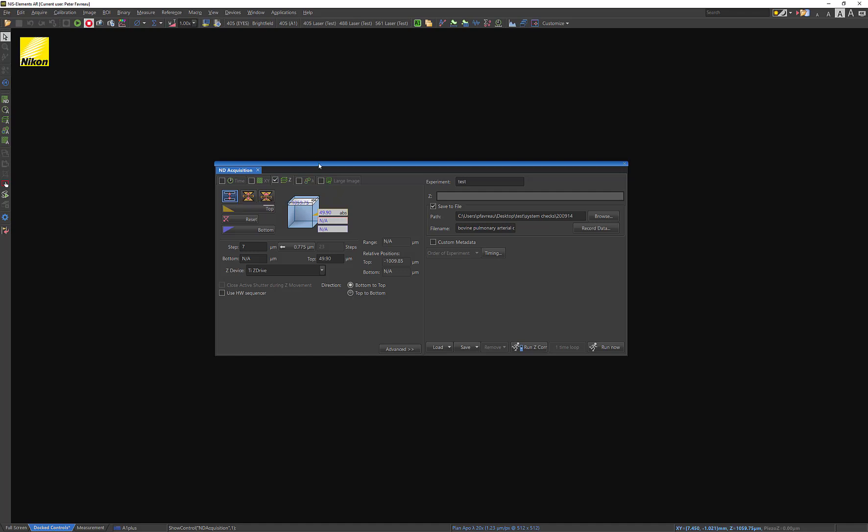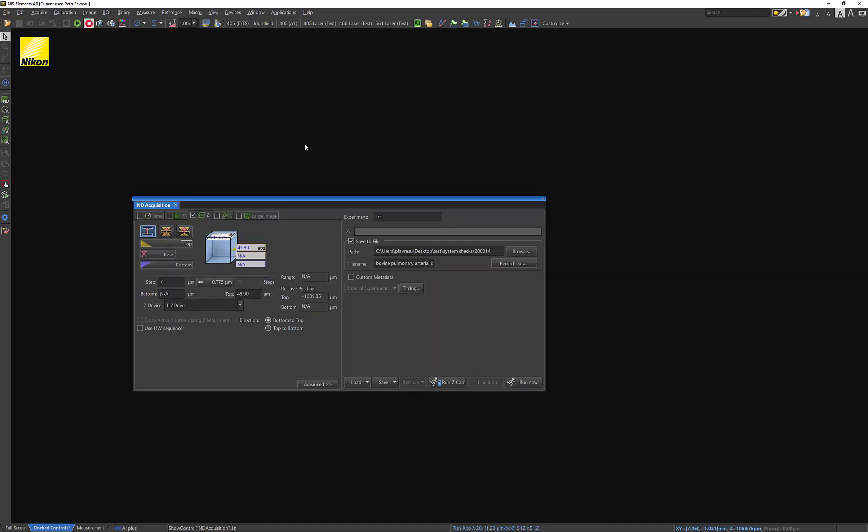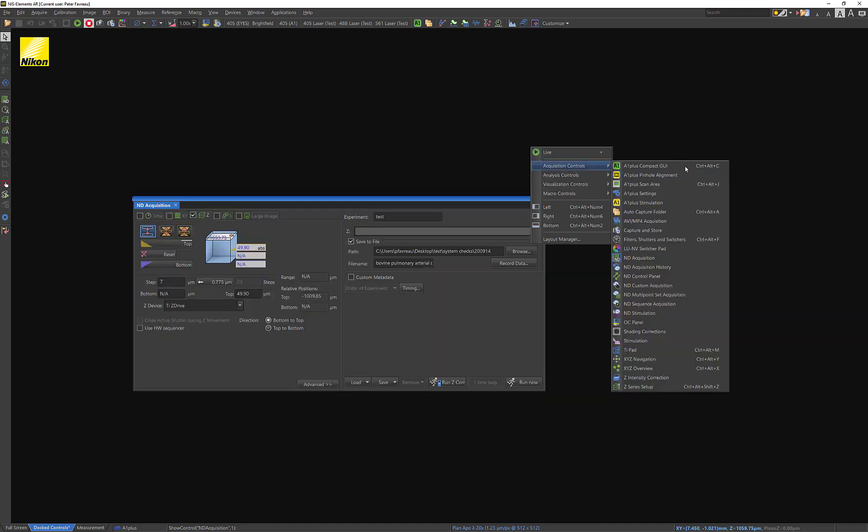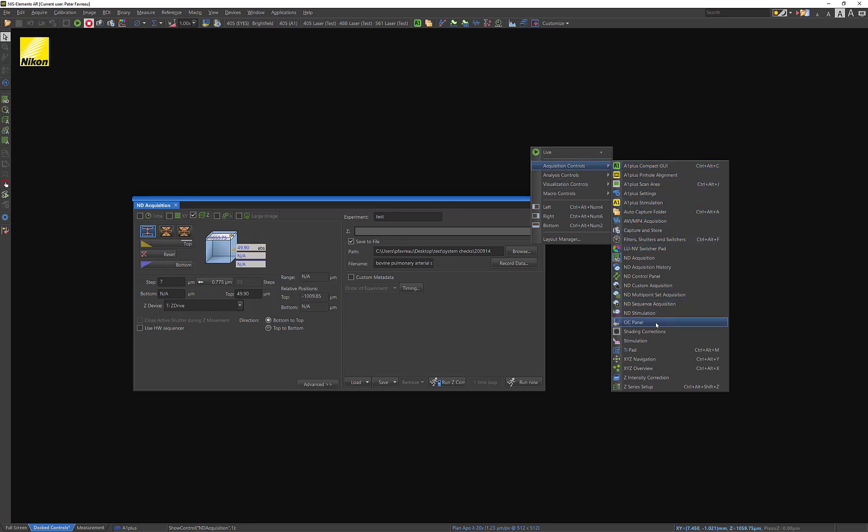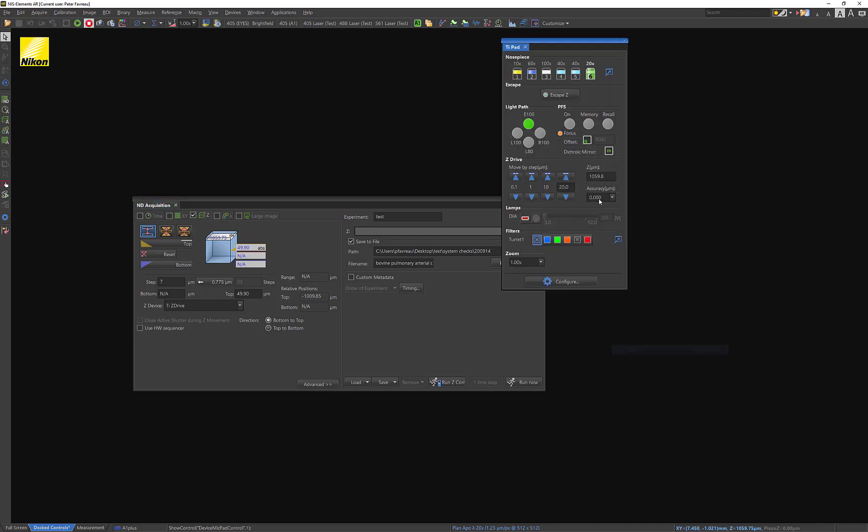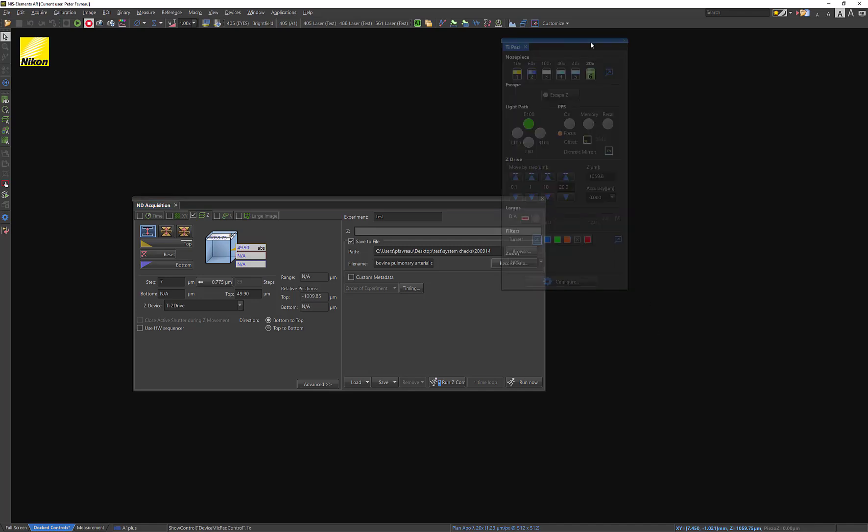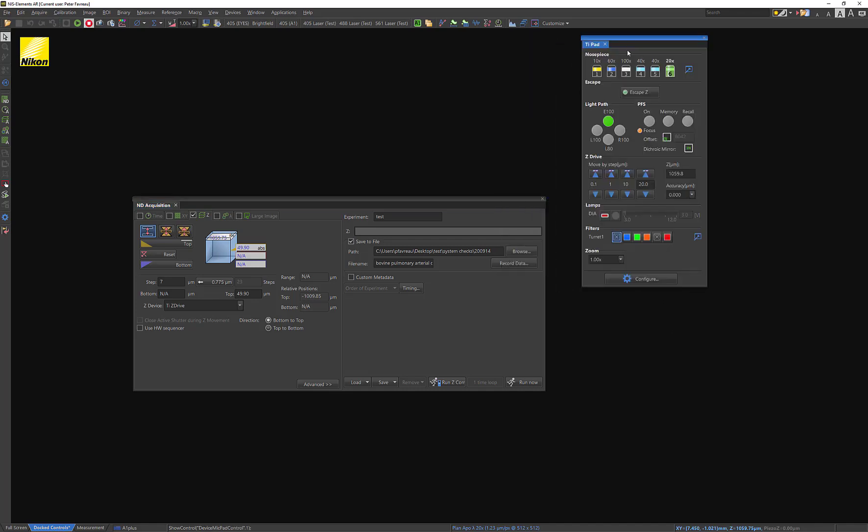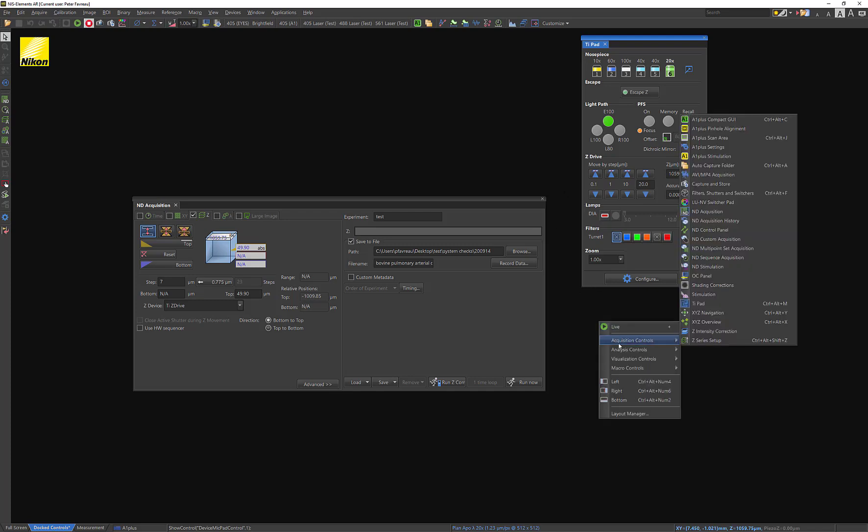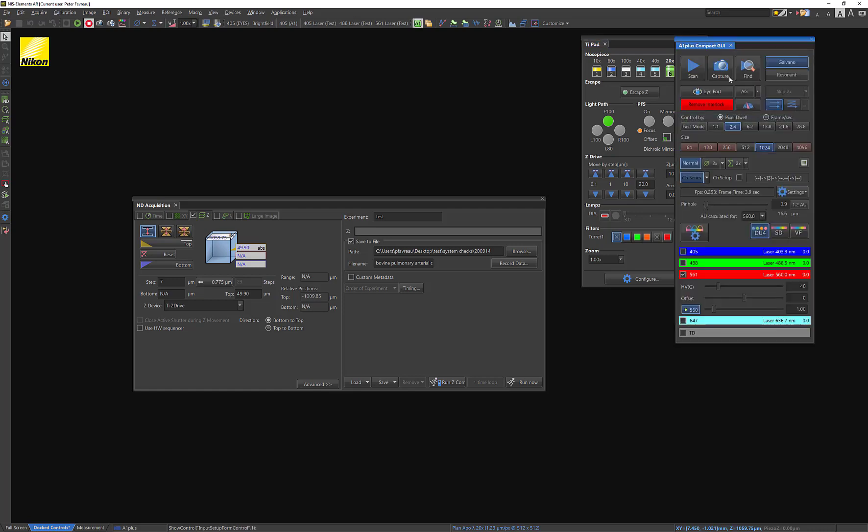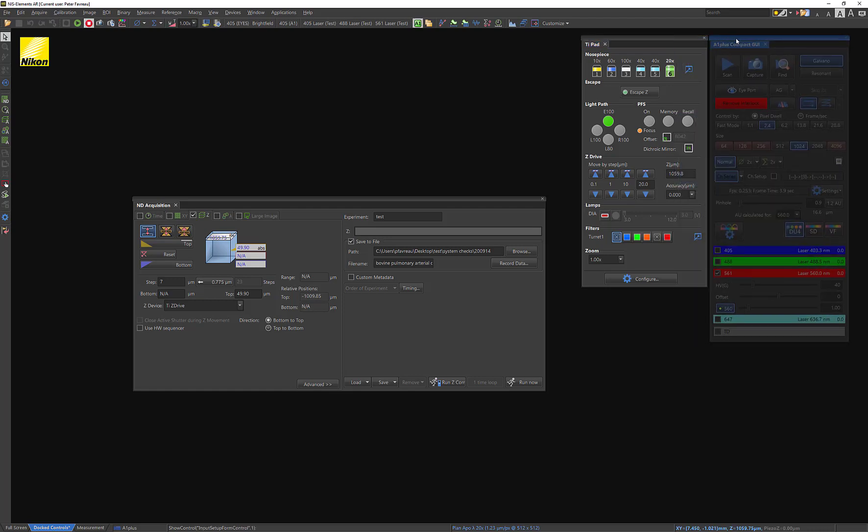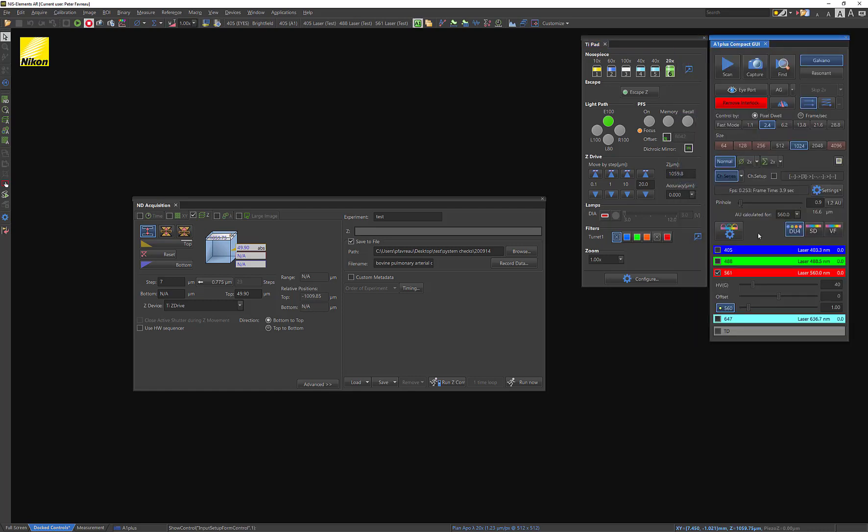And I've got a sample already present on the stage. I'm actually just going to go ahead and show how this kind of works in practice. So I'm going to open the TiPad, which, as you probably already know, is used for all the microscope control. And I also want to open actual confocal components. So to do that, we're going to go A1 plus compact GUI.